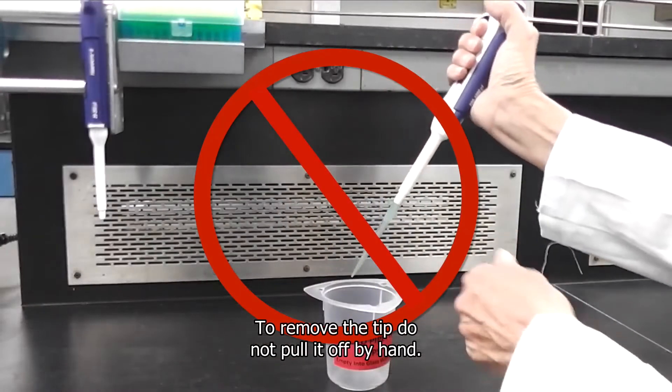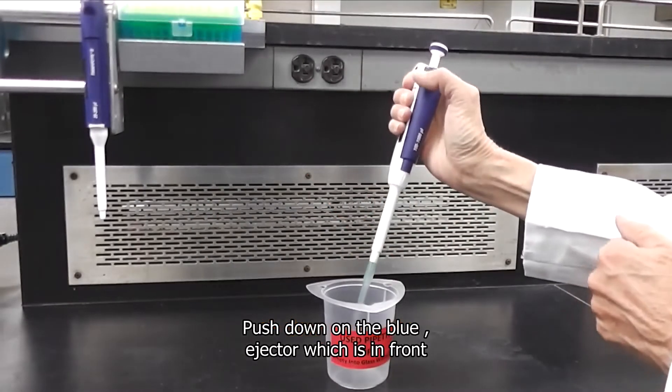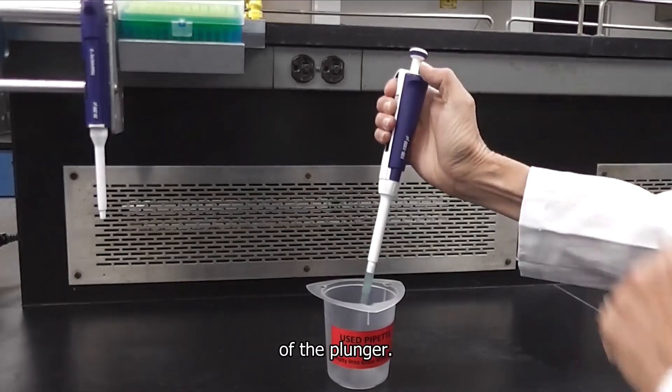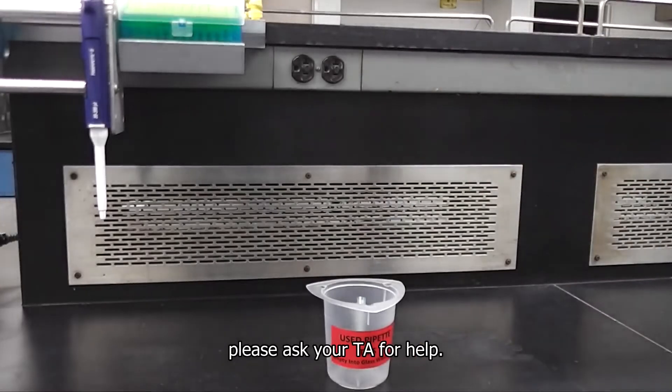To remove the tip, do not pull it off by hand. Push down on the blue ejector, which is in front of the plunger. If the tip doesn't eject properly for some reason, please ask your TA for help.